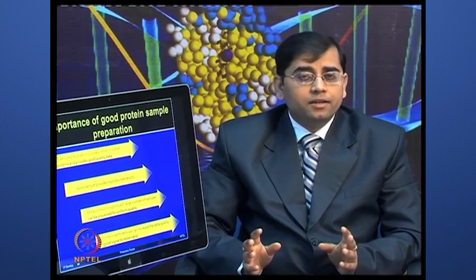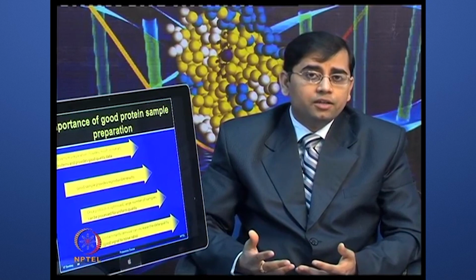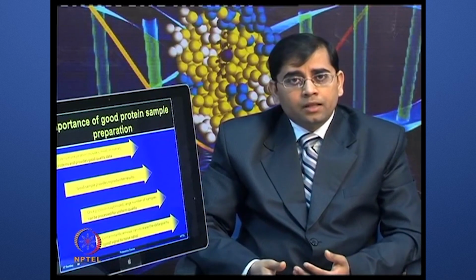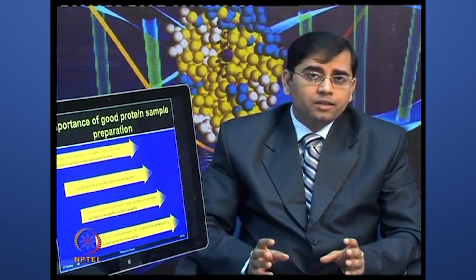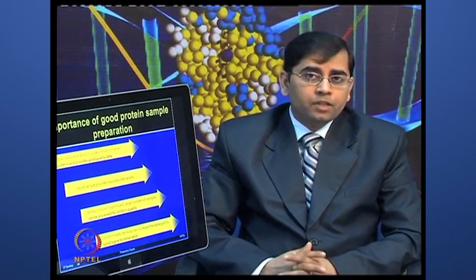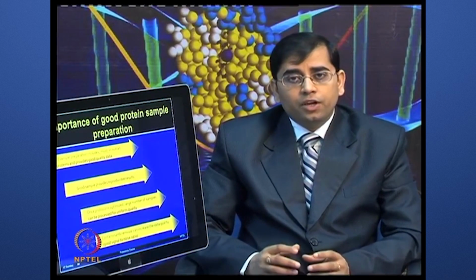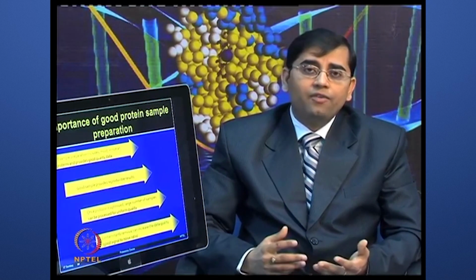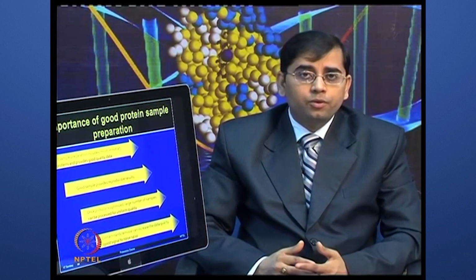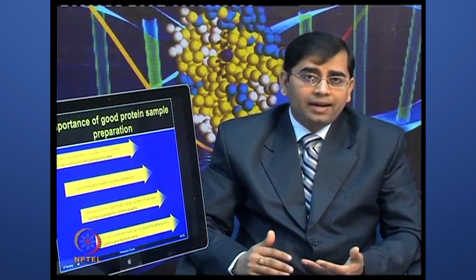Once you have optimized a protein extraction protocol, then you can apply the same protocol for large studies. For example, if you are performing a clinical trial study on 200 patients, once you have optimized the protocol with a small population, then the same protocol can be applied for a large number of samples. So, that is going to ensure the success of the clinical studies. Now, if you are able to remove a lot of contaminants or artifacts present in your sample, then your signal to noise ratio will improve. You literally see your good signal and do not have to worry too much about how to remove the background and the noise.